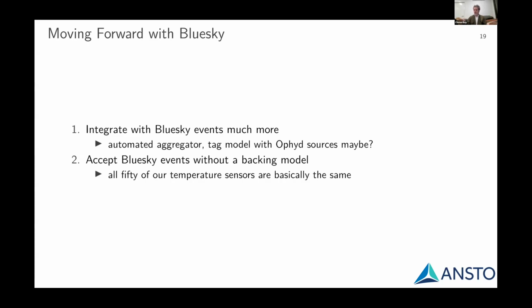And as long as they're nicely individually named, I don't really care. And a really big goal is, once an experiment has generated an HDF5 file, in 12 months' time, maybe the user wants to come back and rerun their experiment with a slightly tweaked sample, for example, or do something slightly differently. I want to be able to take the HDF5 file from their previous experiment and set up the beamline in exactly the same way and then let them tweak things.